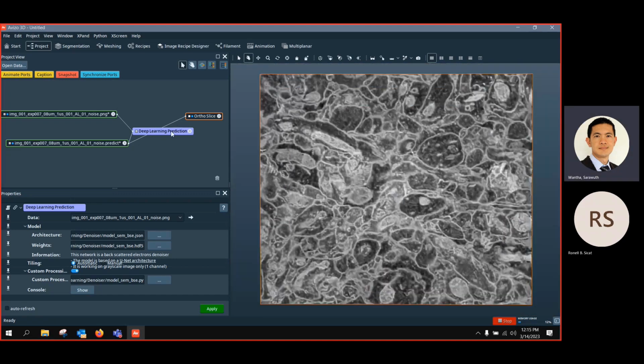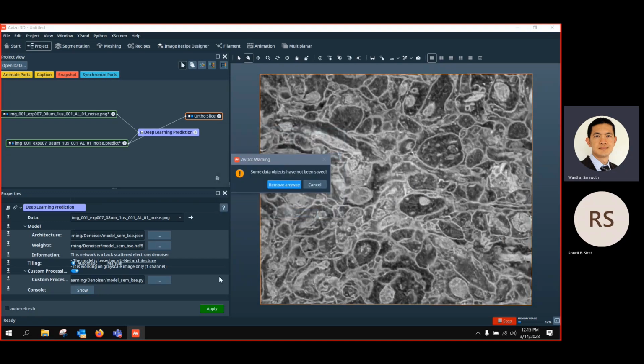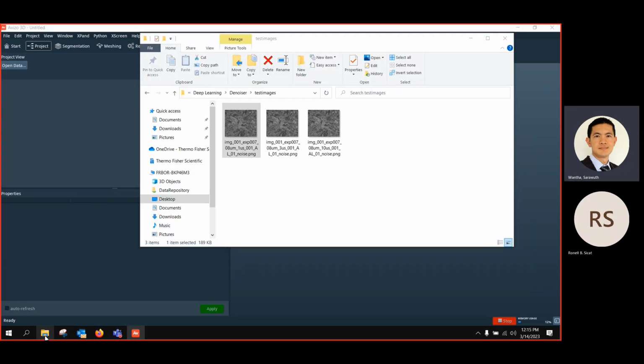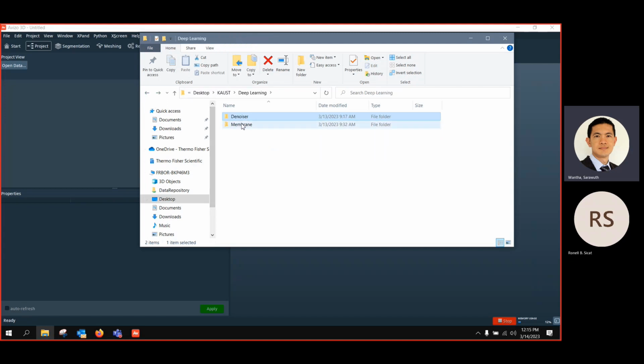So as you can see, we already provide one trained model, but the rest could be custom developed, or you can consult with DGN up there. They can train and create a model for you, to provide this kind of model. Another example as well that may be of interest to you: I have this trained from a real data set.